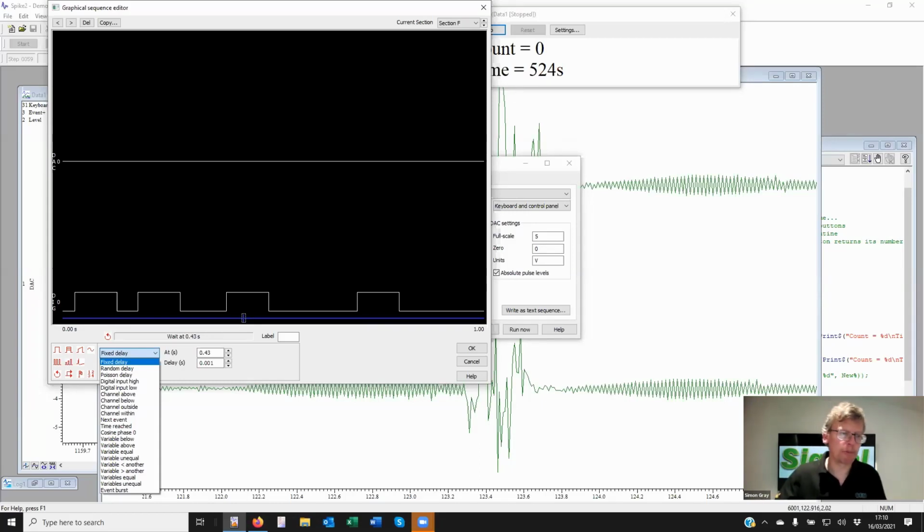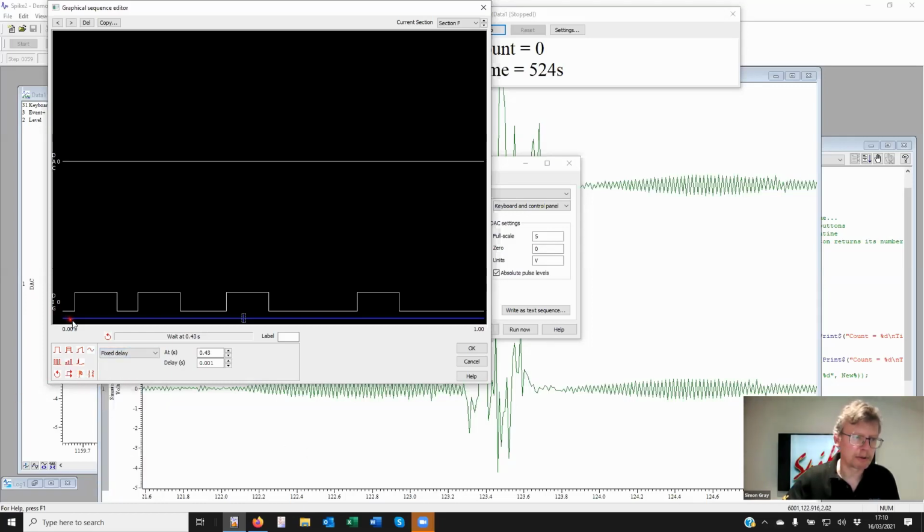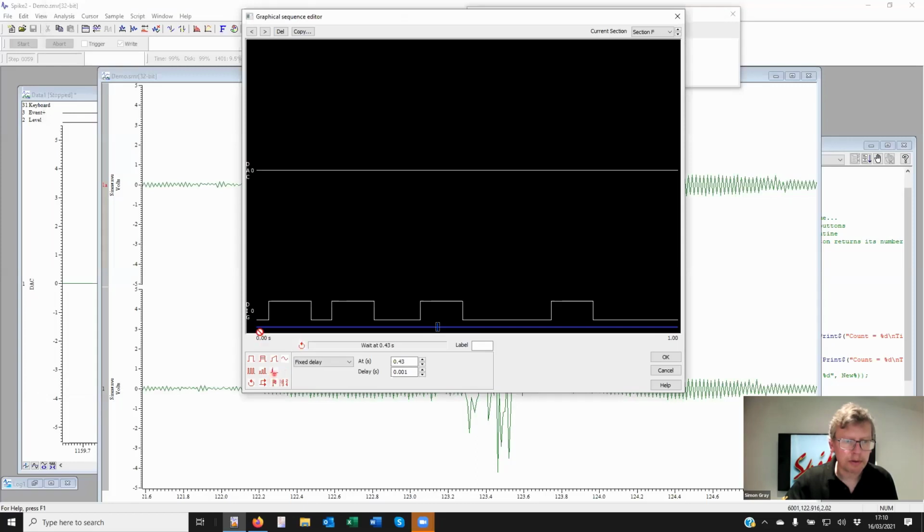Okay, but that's where we might use a digital marker. Say here. Now, where am I? Can I do this? A marker somewhere in here, just to put in A, B, or C, for example, at some time point into the section. So possibly at the first pulse out. Okay, I hope that answers your question, Jessica.